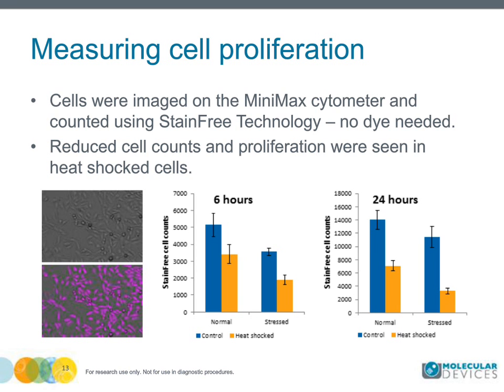So this can be done in different ways through the software. There are a number of predefined settings that we have where you can simply click on a setting and have the software automatically find all the cells in all of your images. And that works for a lot of cells that have common morphologies for which we've developed the settings. If you have cells that may have different shapes and morphologies than we've tested in-house, you have the option to do supervised machine learning, as we call it.